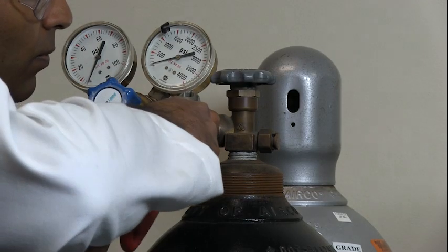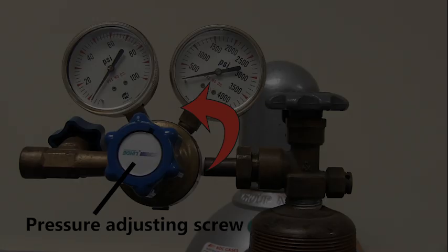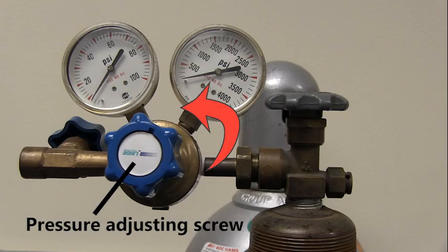Tighten the connection with a smooth-jawed wrench. Turn the regulator's pressure-adjusting screw counterclockwise until it turns freely.